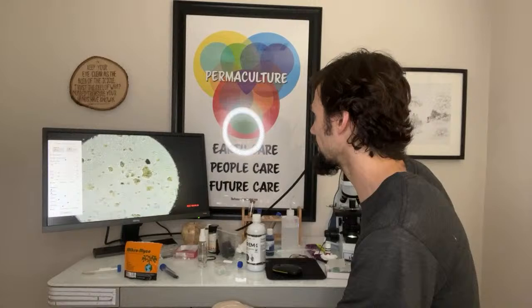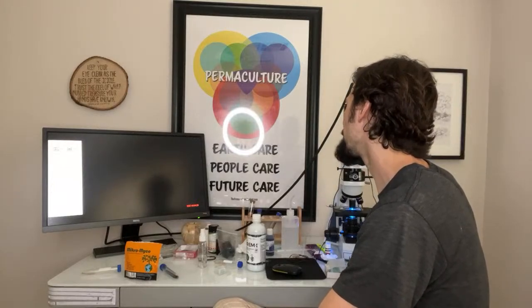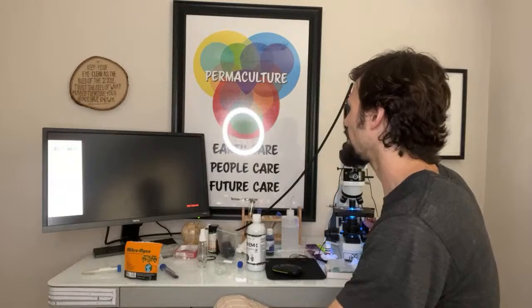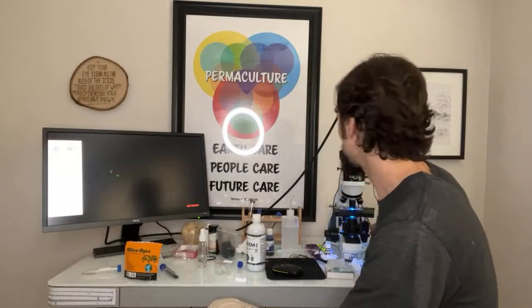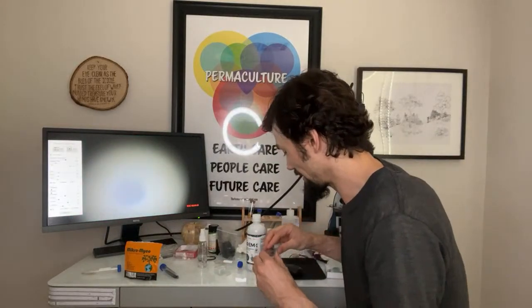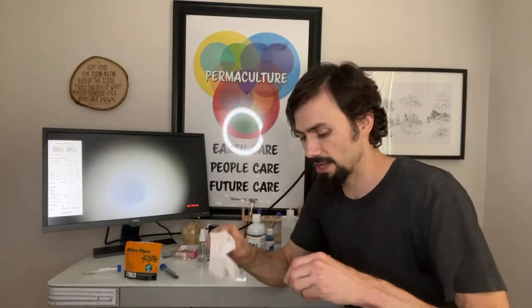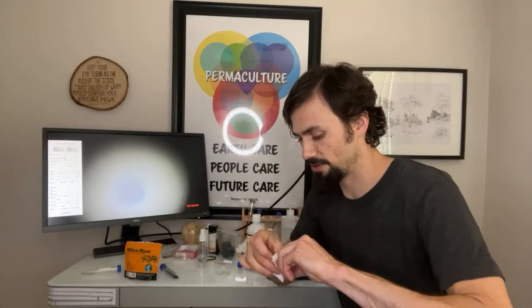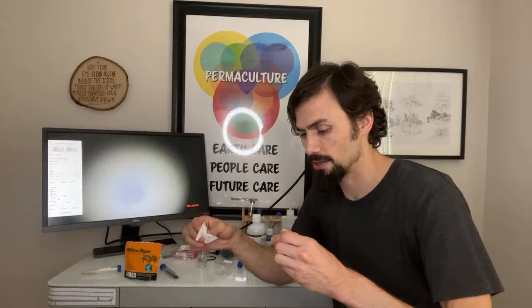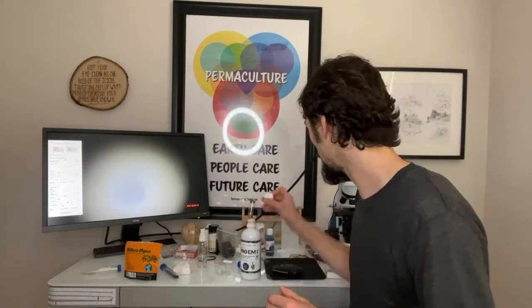But maybe they're inside the aggregates. Let's look at this. There's little bits of fungal decomposition evidence everywhere, like little touches here and there, like little bits autofluorescing. But that's very minor. So I'm not gonna buy that guy again. I think Mycos has the right idea, and I've used them for many years, and I always thought they were good. And it looks like because they chose a better route in general for their products, that they're superior. They have really high concentration.